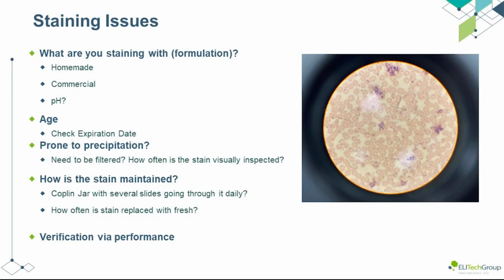When we think back to the ionization of the stains, it's also important to realize that the red and blue stains are opposite charges and can bind each other. However, this only occurs in bulk when the stains are diluted significantly in water, aka your buffer. This is why mixed stock solutions of these dyes are mostly methanol. Some procedures will have you mix the dyes with buffer just before use and then discard that working solution immediately afterwards. This is because, again, the dye will precipitate in water.